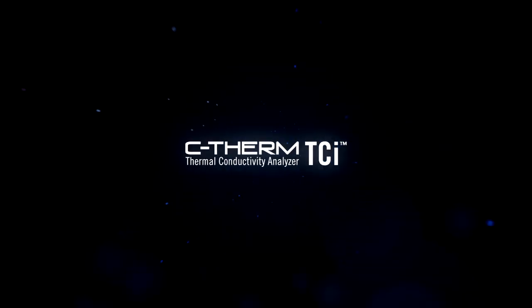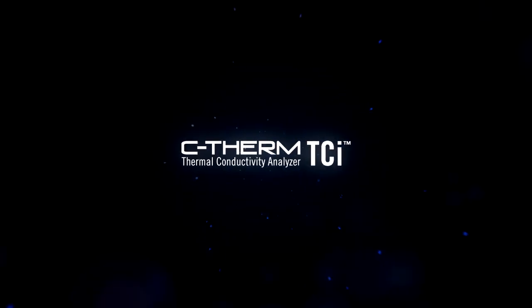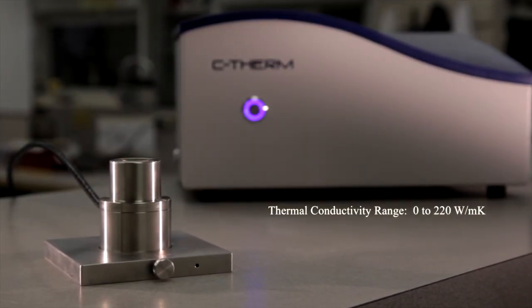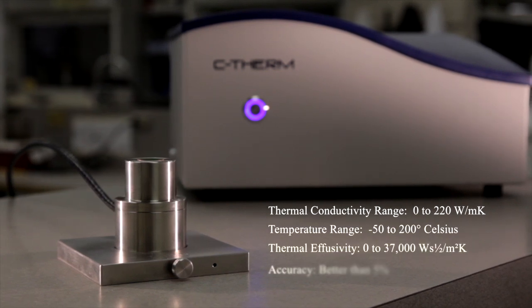The new and improved C-THERM TCI Thermal Conductivity Analyzer substantially increases the thermal conductivity range, temperature range, and sensitivity of the electronics.